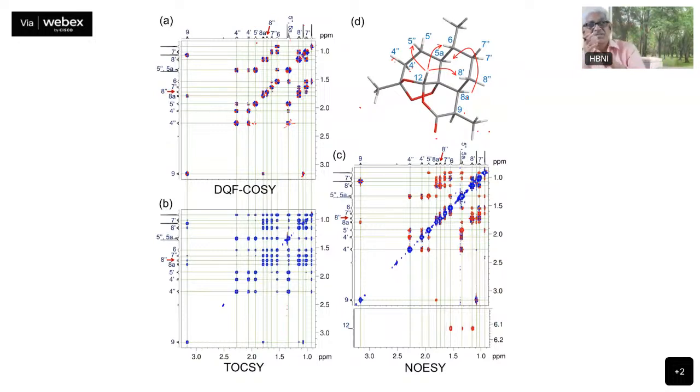Because the coupling is small, the positive and negative things cancel out, so you don't see that peak. Therefore, the angle is 90 degrees, and it's becoming very close to 0. Exactly. So therefore, you are not seeing that one there.